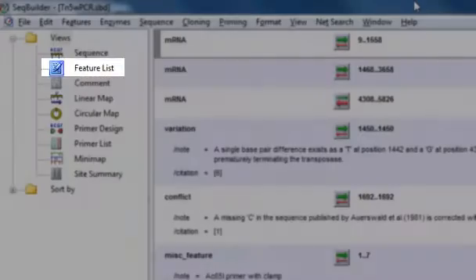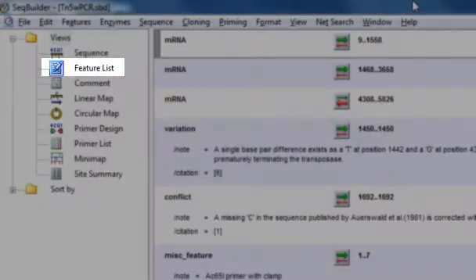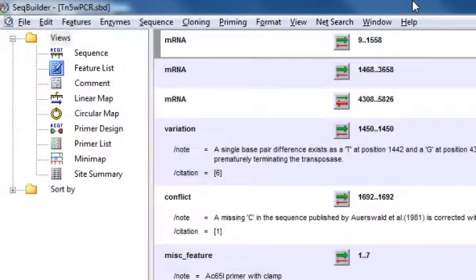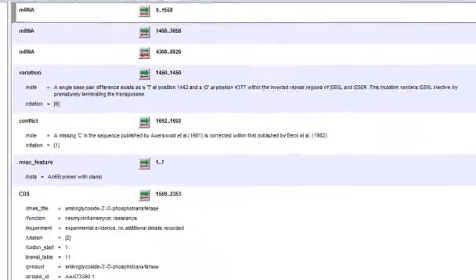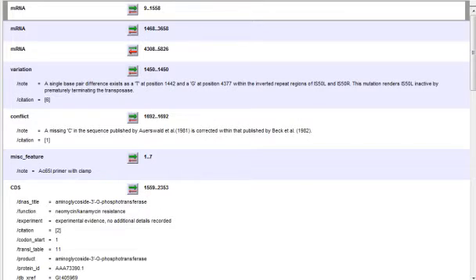The Feature List View displays all of the defined features for your sequence. And these can either be predefined features from another source, such as GenBank, user-defined annotations that you create, or features created in another LaserGene application.